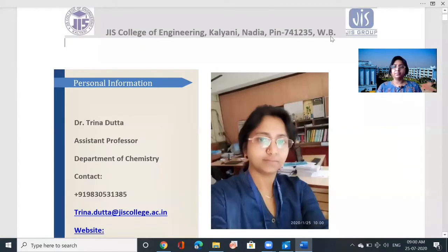Hi, good morning. This is Trina here to discuss spectroscopy. The basic principle of spectroscopy, UV-visible spectroscopy, IR spectroscopy and NMR spectroscopy.